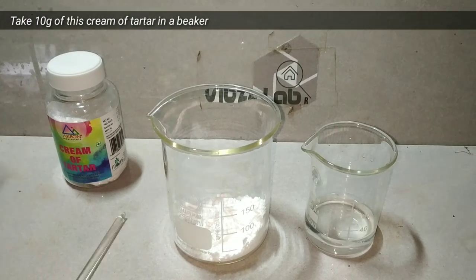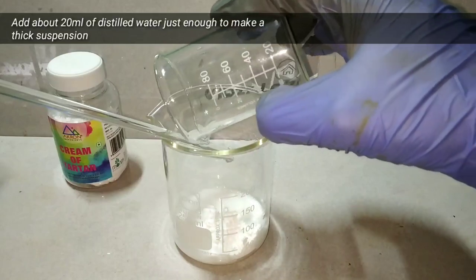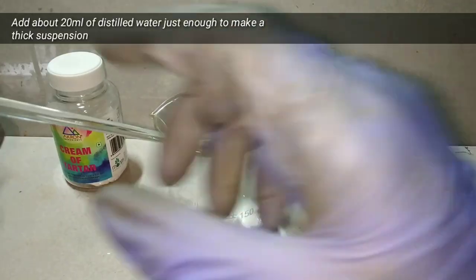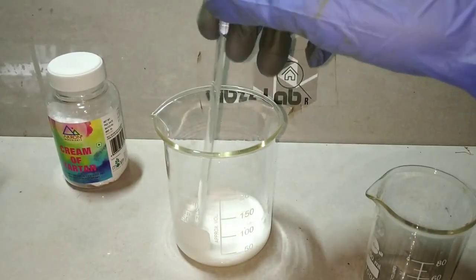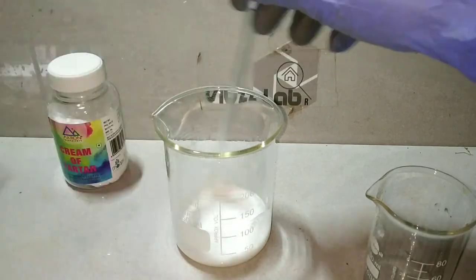We take about 10 grams of it in a 250 ml beaker. As you can see, it is a white fluffy powder. Then you add about 20 ml of distilled water to make a thick suspension of it. Stir it up well.